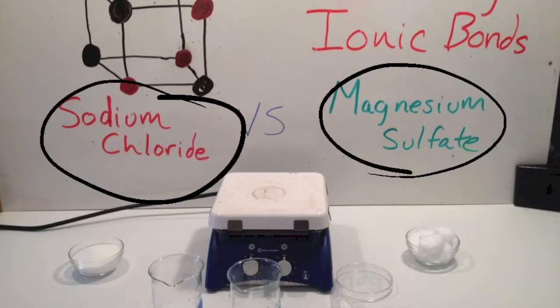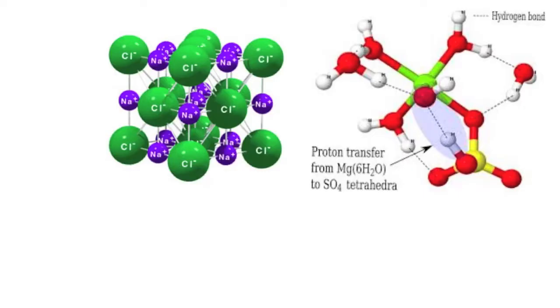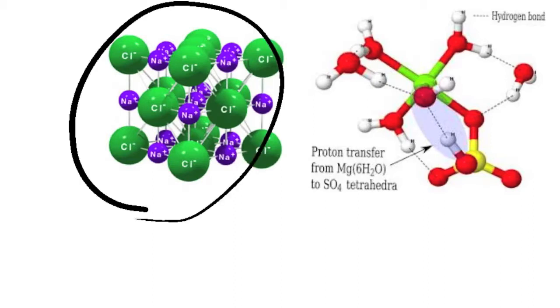Some of the tools that we're going to use include the hot plate, petri dishes, beakers, and pipettes. You can see some pipettes. And we're going to use these tools to learn about the structure of the sodium chloride molecule and the magnesium sulfate molecule.